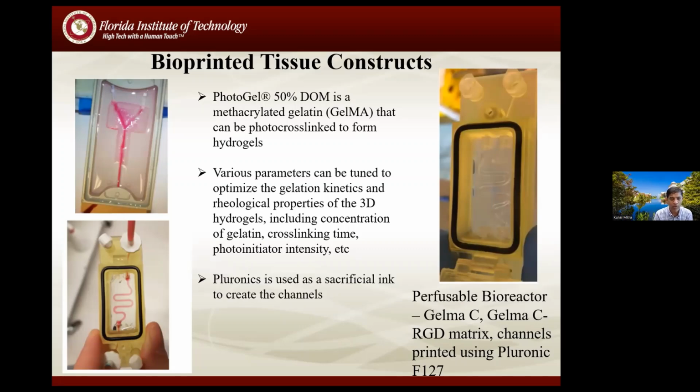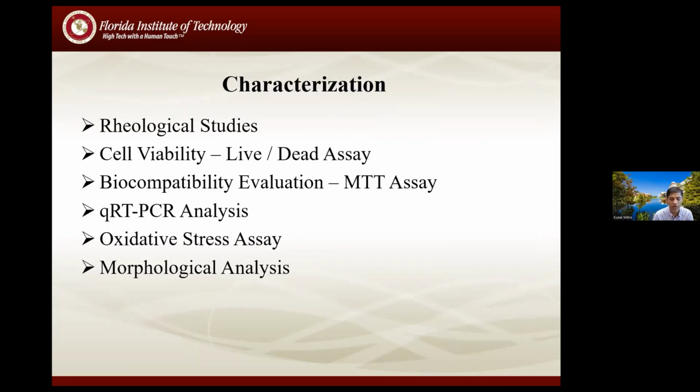So we are really working with them very closely to develop a platform, or a database, of what type of materials to use. Initially, when we started, we were buying from a very well-known company, Advanced BioMatrix, one of the biggest companies in the US that supplies a lot of biomaterials. But we realized that we were losing control. So I took a breath for a month or so, and then developed this relationship. You're not seeing these results here because part of this is under the NDA, and part of it is papers under review. But even with these, we got very good prints. Now we have an even higher level of prints, well optimized for different materials and different types of cells.